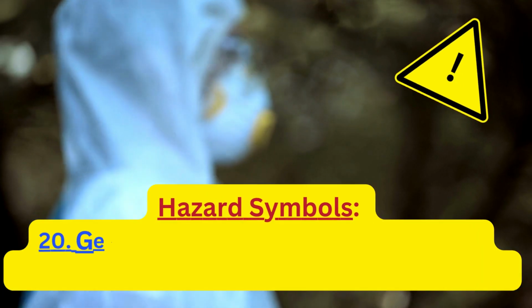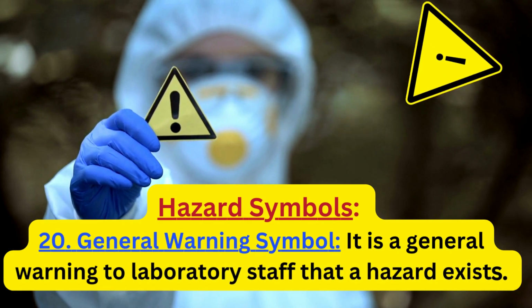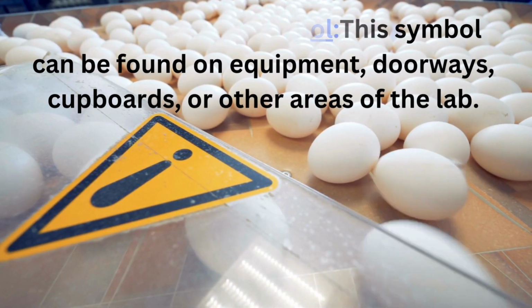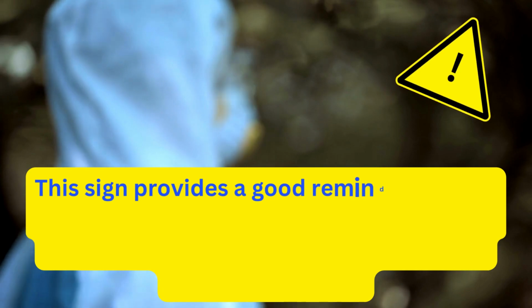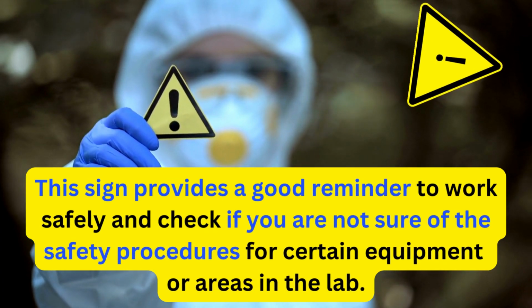Hazard symbols. 20. General warning symbol. It is a general warning to laboratory staff that a hazard exists. This symbol can be found on equipment, doorways, cupboards, or other areas of the lab. It provides a good reminder to work safely and check if you are not sure of the safety procedures for certain equipment or areas in the lab.